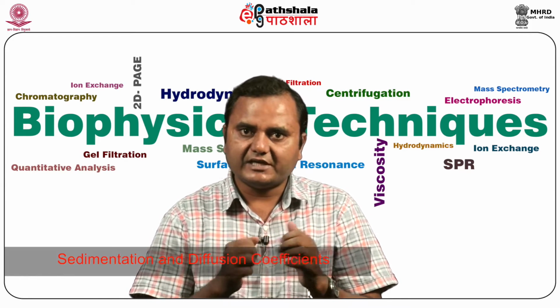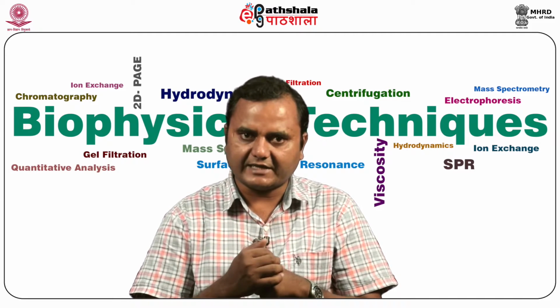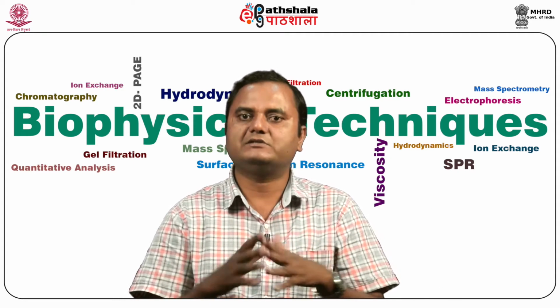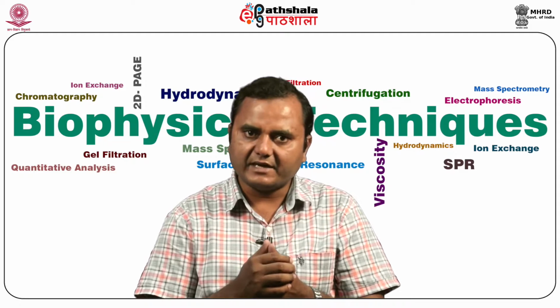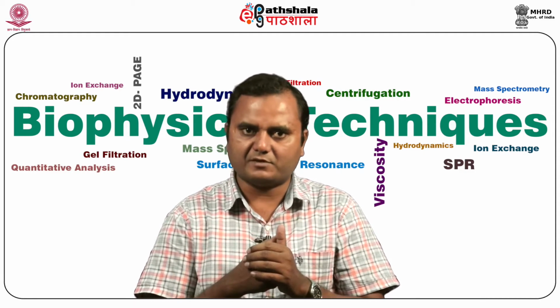Sedimentation and diffusion coefficients measure the macromolecular complex size and interaction, how big the complexes formed are, and in the reverse way, how the complexes are broken into the different components. This technique is also utilized for ligand binding studies to distinguish ligand from the acceptor by differing absorbance.